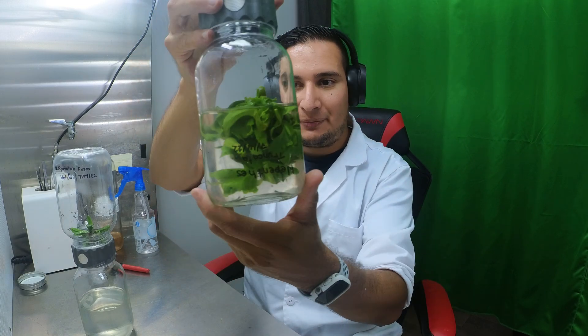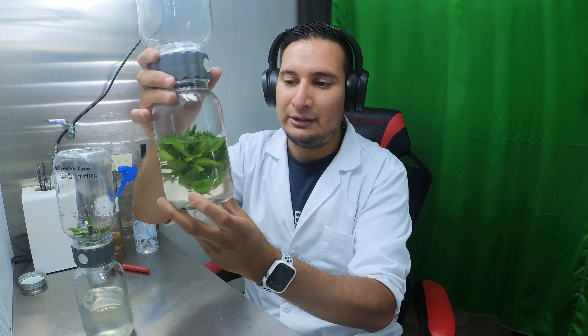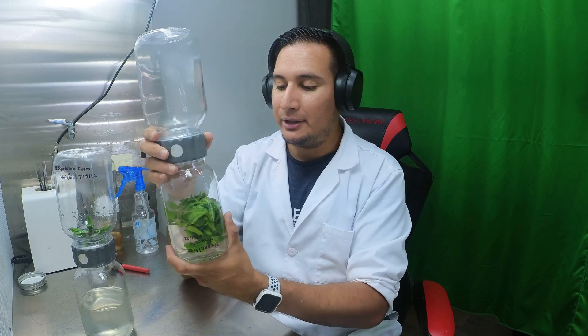Starting from the initial two small plants just over a year ago, this is how they look — they look great. The media will probably turn brown because Nepenthes truncata has tannins that leach into the media. That's why the media in the other biocoupler looks brown — it's not contamination, it's natural tannins from the plants.